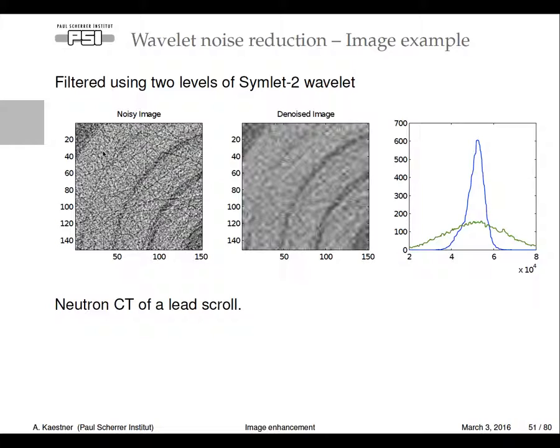When I tried to filter this one with the wavelet, you can see that I can get rid of the noise. Well, good. I can still see some of the structures. Maybe I did too strong filtering. But the interesting thing is these wavelet artifacts that you can see in some places, like small ripples at some spots.